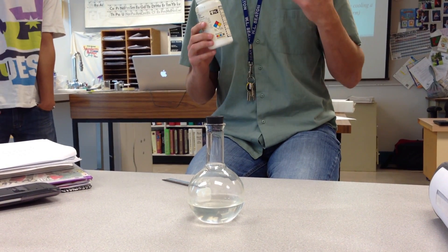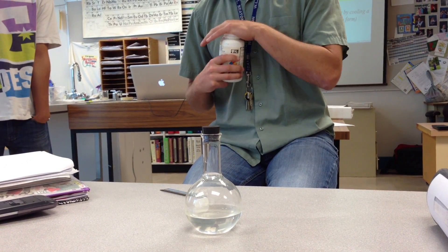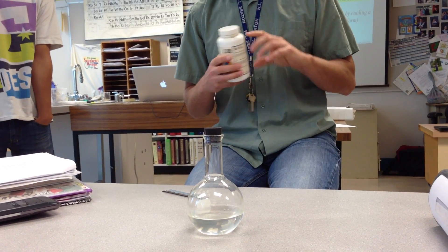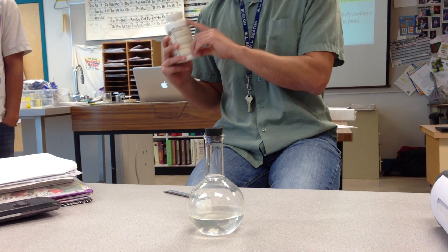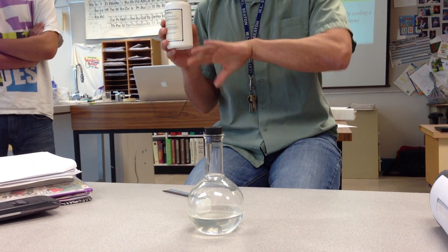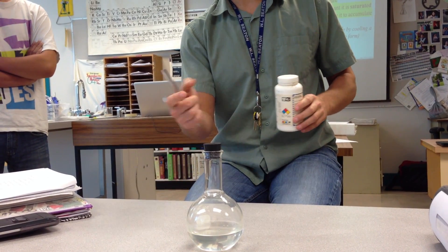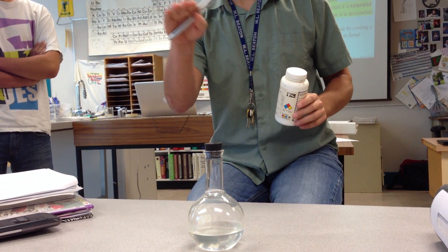It turns out that is not stable at 20 degrees Celsius, which is approximately what we have here. I can't dissolve nearly that much sodium acetate in room temperature water. If I tried, I'd get a bunch just sitting at the bottom. So I made this at high temperature and then cooled it down.